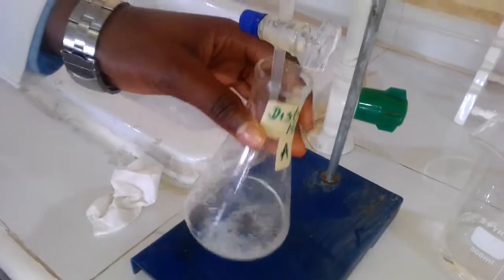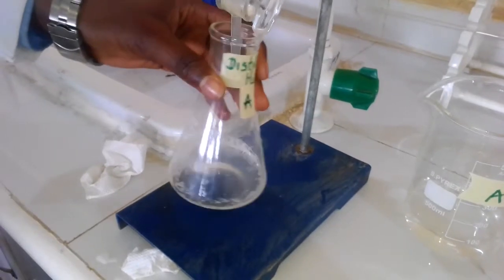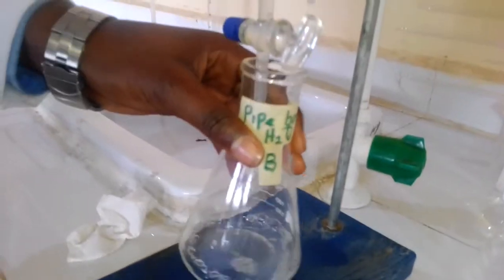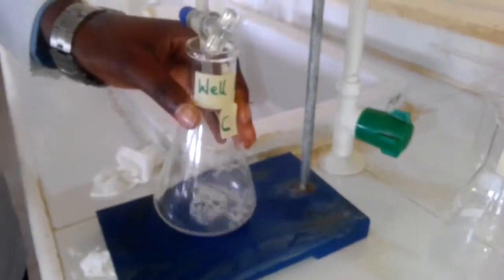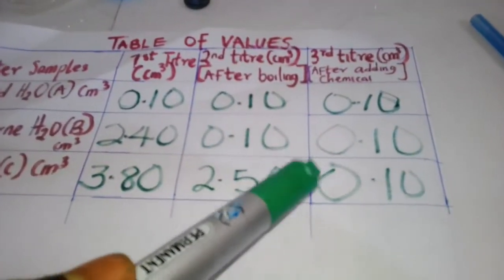For the distilled water, exactly 0.1 ml of the soap solution was used to form lather. For the pipe-borne water, exactly 0.1 ml was used to form lather. For the well water also, exactly 0.1 ml of the soap solution. Then we enter our values into the table of values.